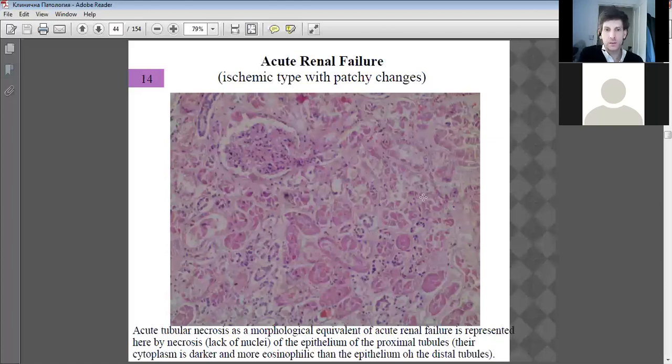There's a lot of darker areas forming. This one is necrosis, necrotic areas. Okay. I'm trying to see if I can find some other necrotic areas, perhaps starting to form. So the necrotic areas are the darker ones? Yeah, the darker ones. And notice there's fewer cells dividing in the tubules.